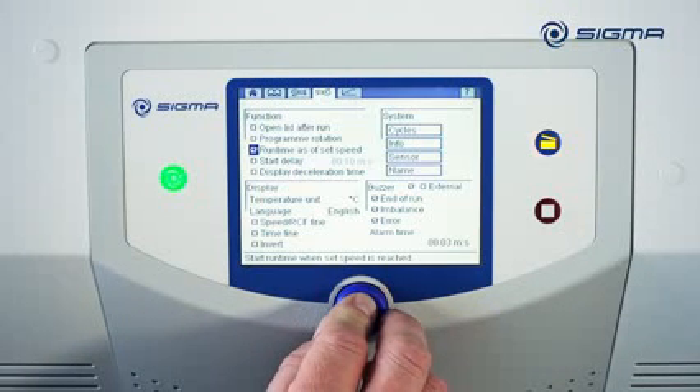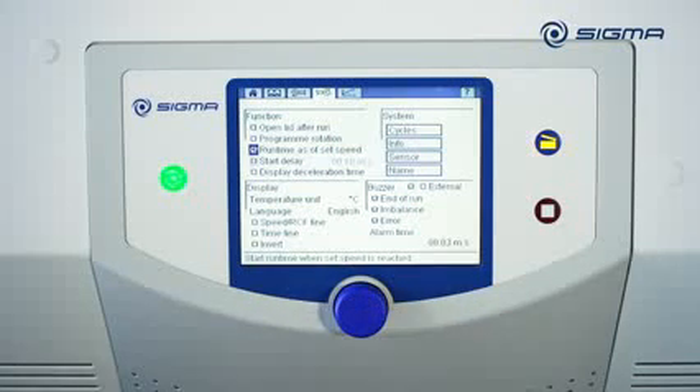If the Runtime as of Set Speed option is enabled, the centrifugation runtime does not start until the pre-selected speed is reached.